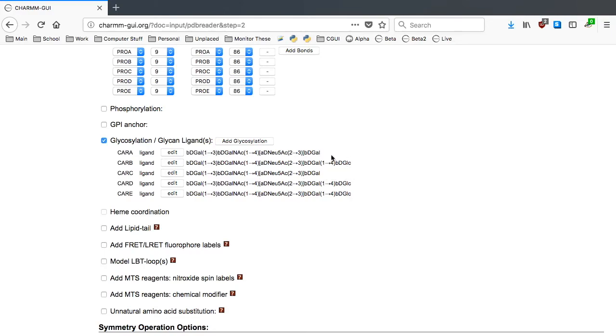As you can see, carbohydrate A and C are missing a beta-glucose at the reducing end. Each of the carbohydrates should also be linked to a ceramide. First click Edit on Carbohydrate A.